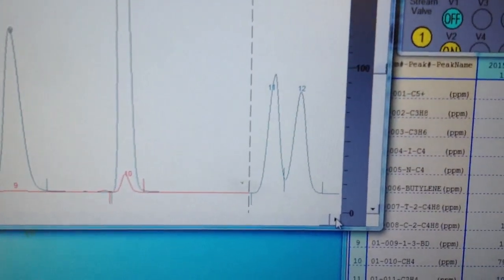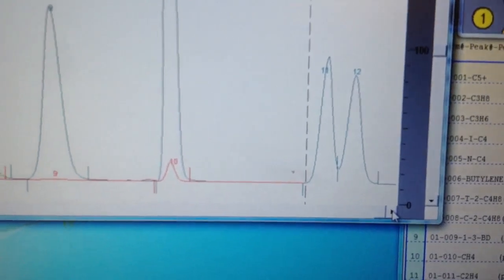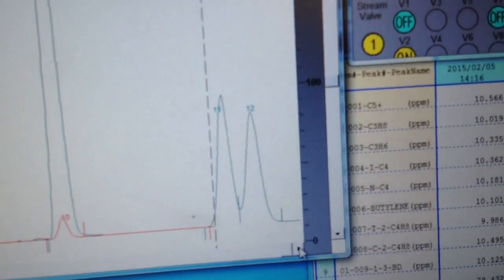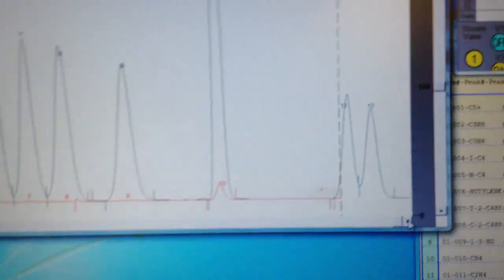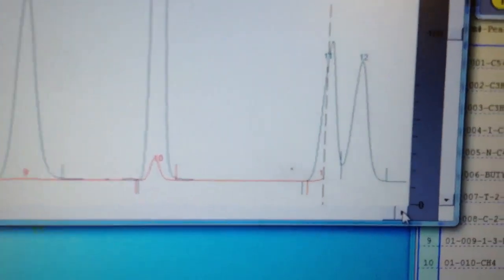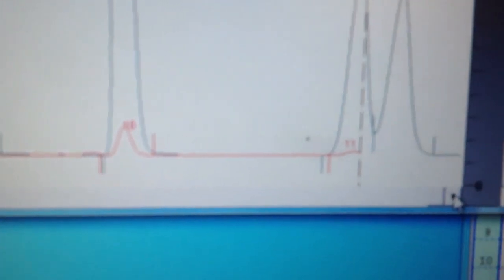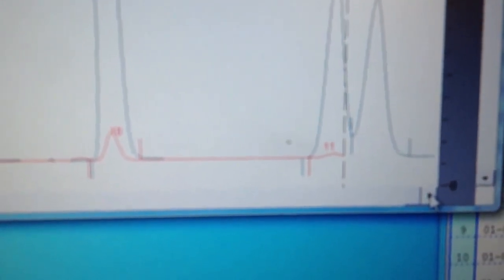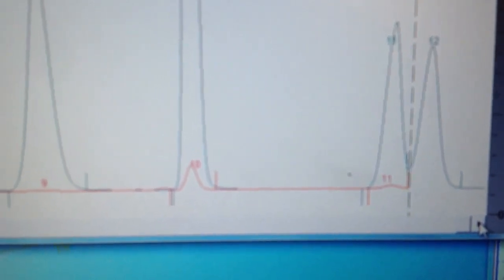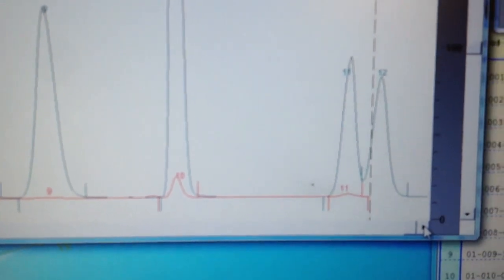We might have a smidgen of ethylene in there. So let's take a look and see what happens there. But yes, we definitely have a little bit of methane, and that comes from our instrument air. Yeah, it's a tiny bump. It's a baby bump. So there's a little bit of ethylene and no ethane. It will go down in a flat line saying no ethane.